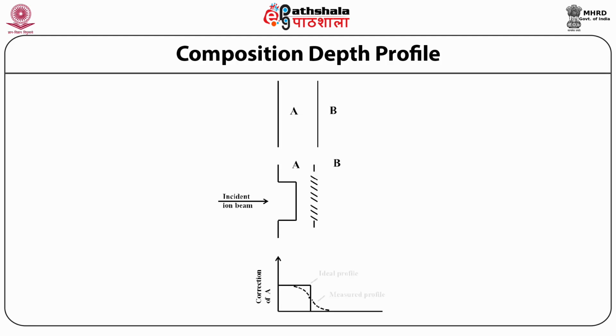Figure 4 represents the schematic diagram of the interface smearing during depth profiling. When an ion beam gets bombarded onto the surface of a thin film sample with a smooth interface with the substrate, the depth profile of element A often exhibits diffusion rather than the sharp interface profile expected for the real case.